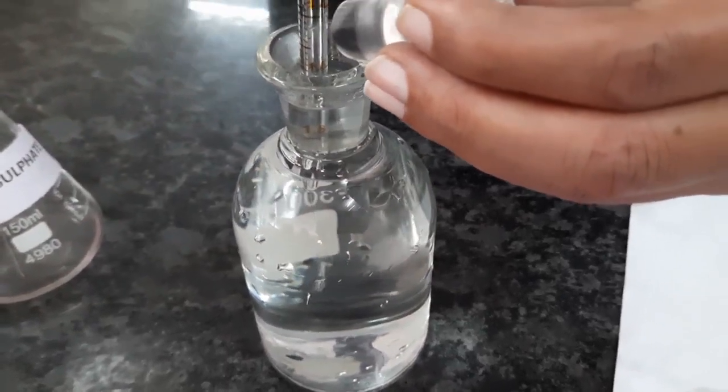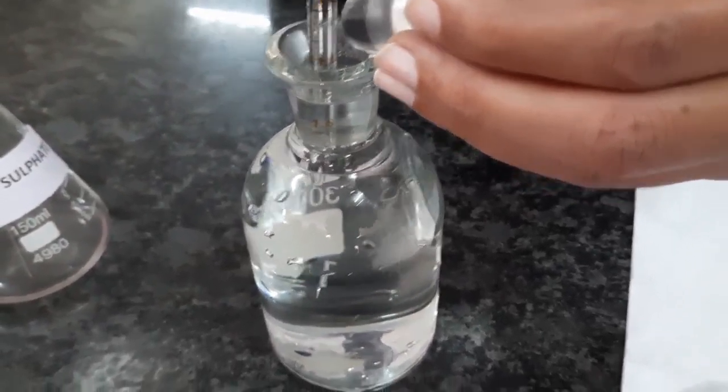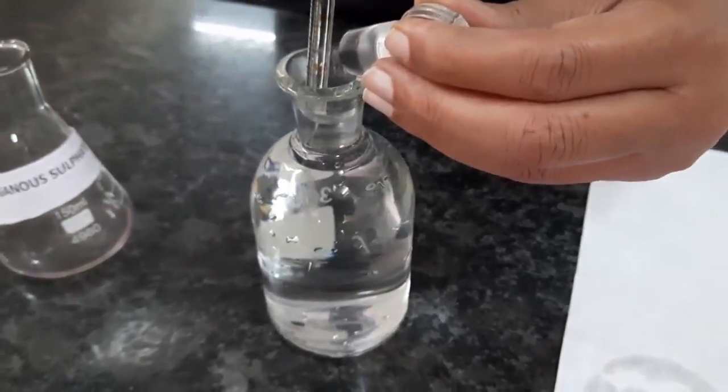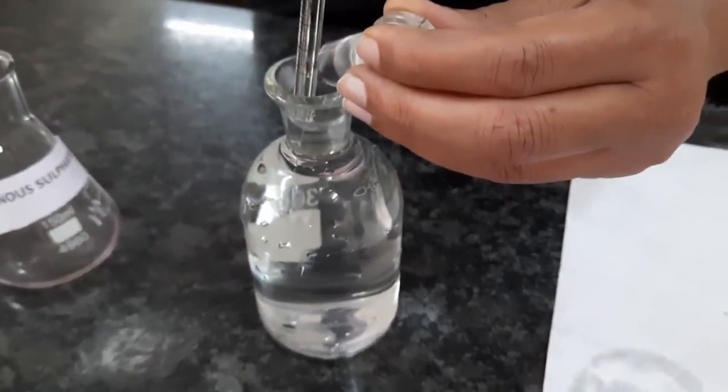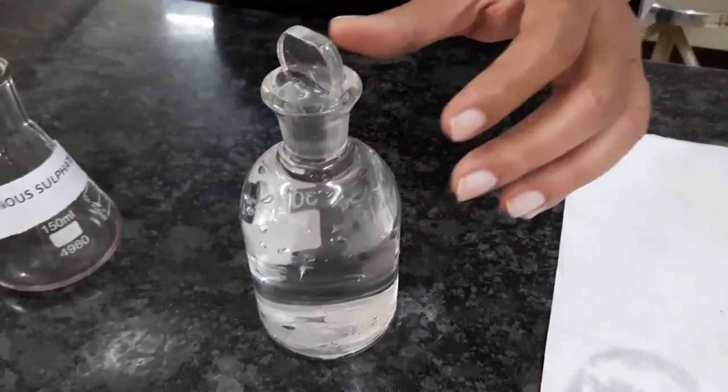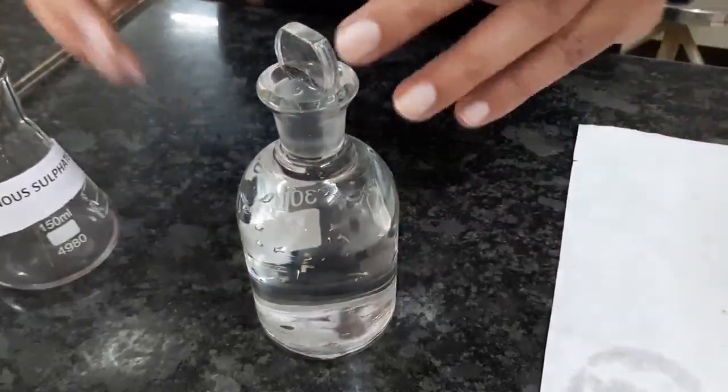Once you ensure that the whole of the solution has gone in, you can take out the pipette and immediately stopper it back. The excess water has to be put out.